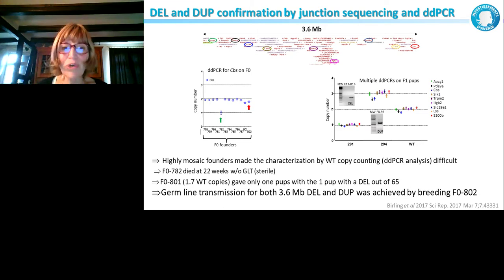And thanks to that, we could look for the junction, because you can see that sometimes we observe that the deletion is a little bit larger than what we expect, and then we need to search for the junction and take oligonucleotides that are a little further than the real expected size. Then that's what was really useful, and this means we were able to obtain the duplication and the deletion of this line in a very fast way, and it was also quite cheap to obtain that.